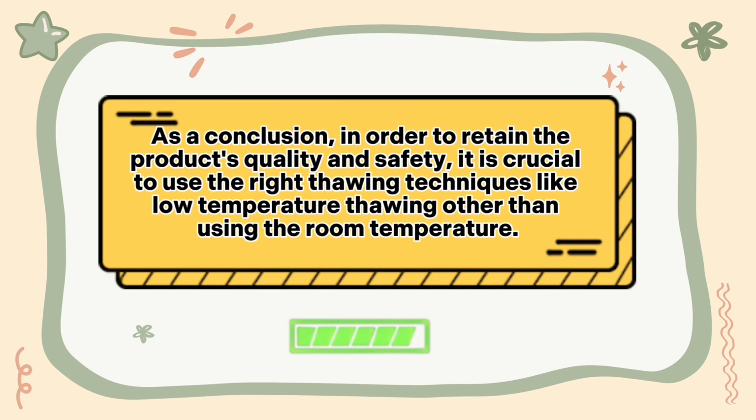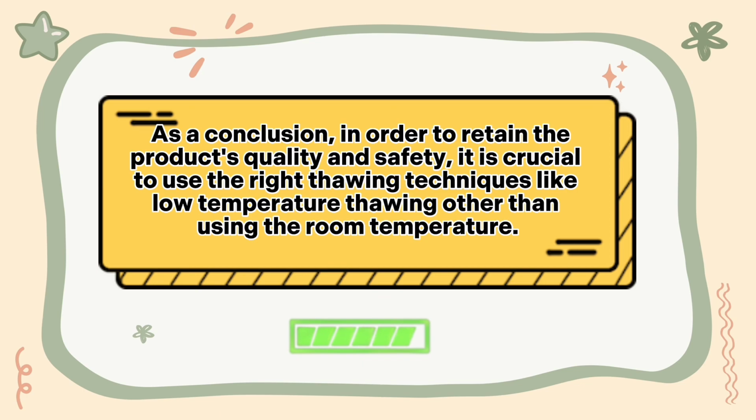As a conclusion, in order to retain the product's quality and safety, it is crucial to use the right thawing techniques like low temperature thawing, other than using room temperature.